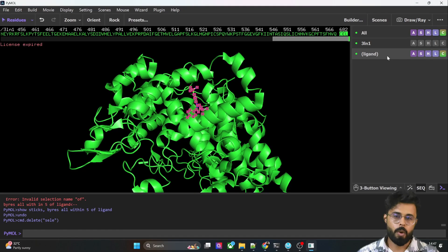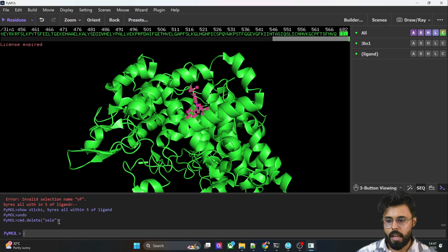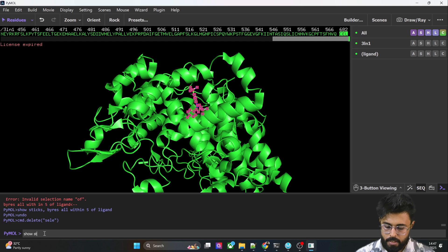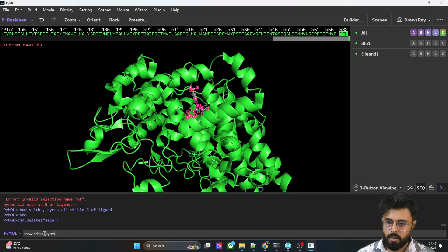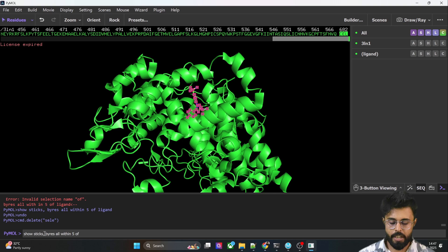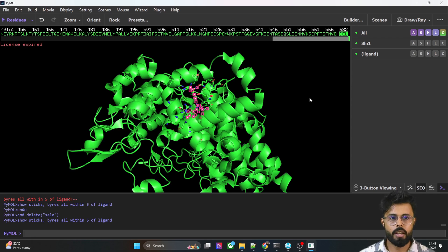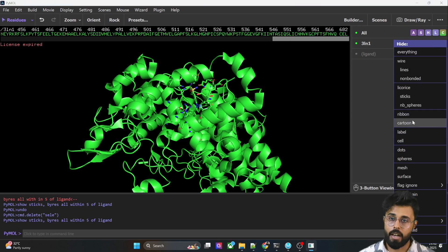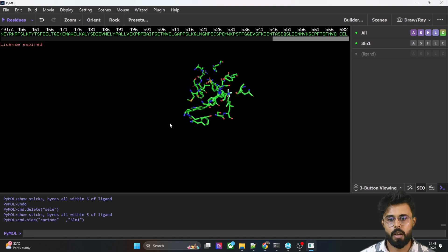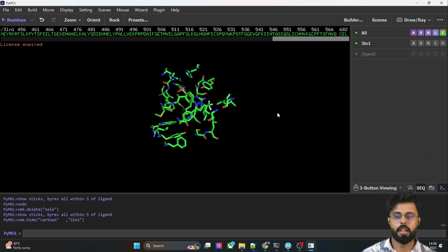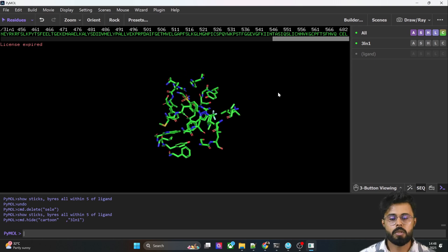The second method is via the command line. You can type: 'show sticks, byres all within 5 of name ligand' and press Enter. It will show all the amino acid residues in stick format. Then, hide the cartoon structure the same way, and it will show all the amino acid residues.